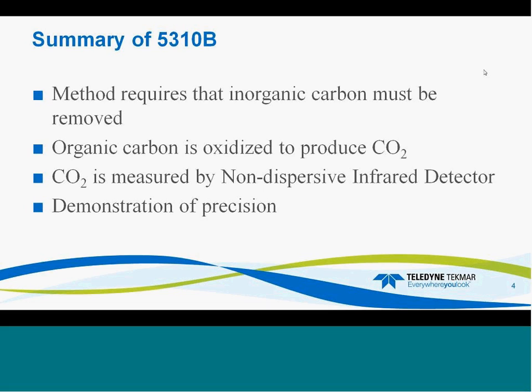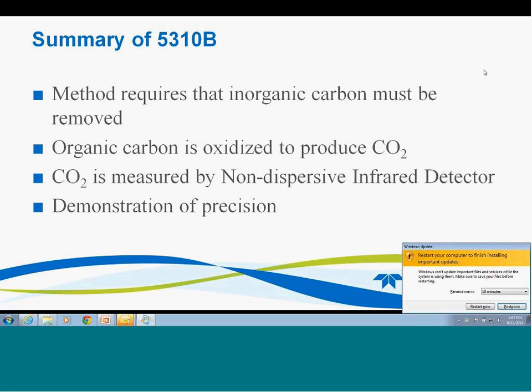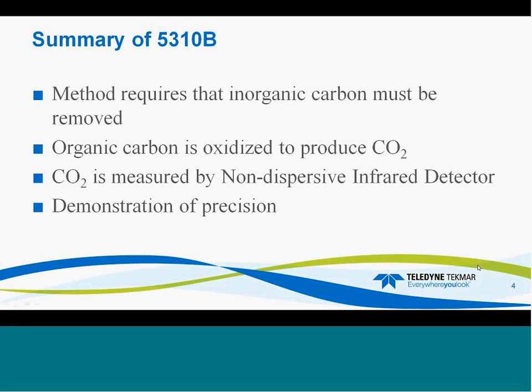First, the inorganic carbon must be removed, and then once the inorganic carbon is removed, it takes the remaining carbon and oxidizes it to CO2, and it is measured by an NDIR detector, so non-dispersive infrared.